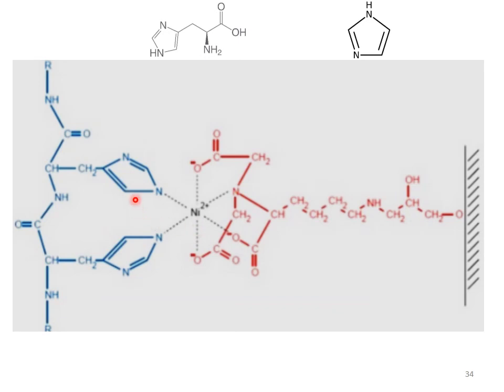Later, these bound proteins could be eluted from the column by using a competing agent called imidazole. This is the structure of imidazole, and it resembles the imidazolium ring of histidine, having a similar nitrogen configuration. So when imidazole molecules are added, they compete with the histidine tag proteins, and they displace the protein, and they themselves bind to the nickel ions present on the column.